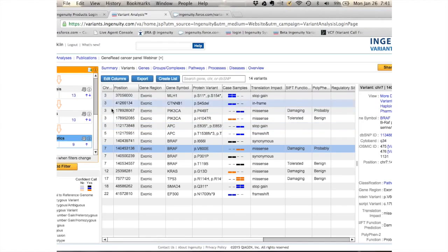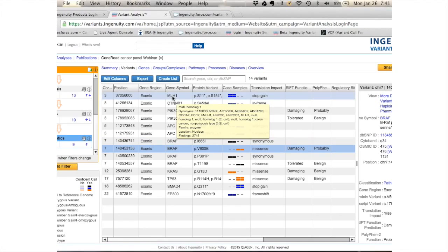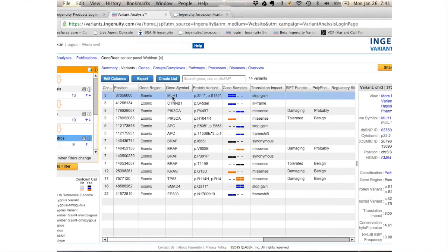On the right side of the screen, you have your results. You have the different chromosome, where is the position, and so on, as I discussed. And for any of the variant, when you click on the row, you have at your fingertip all the information, so you know what they are. You have a visual diagram, case and control. Here I have only case in this analysis, so I have only tumor in this case.